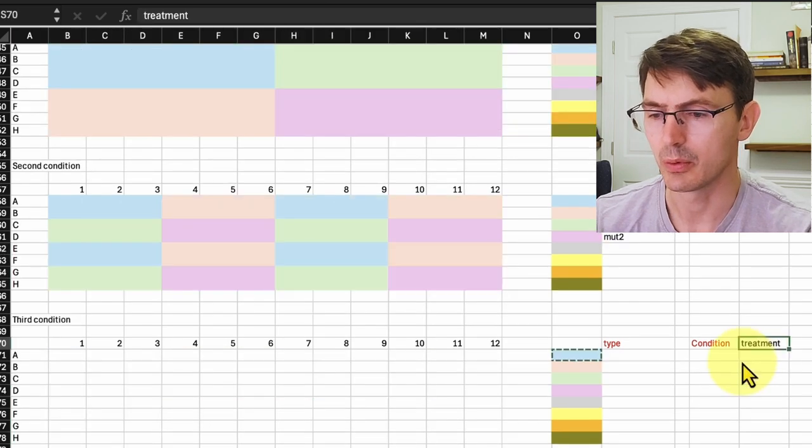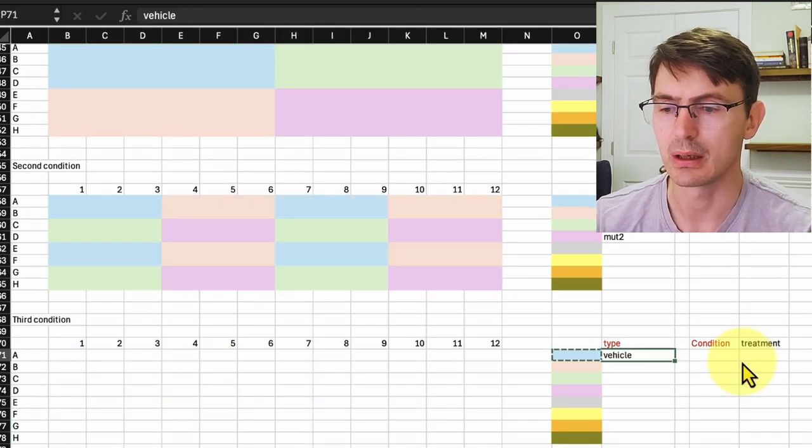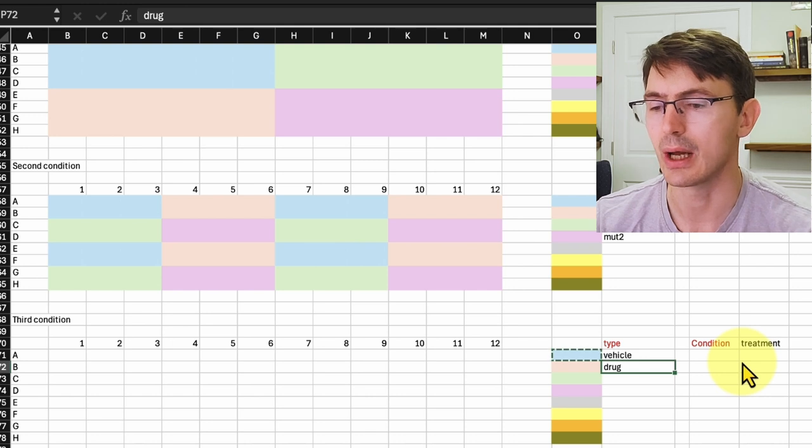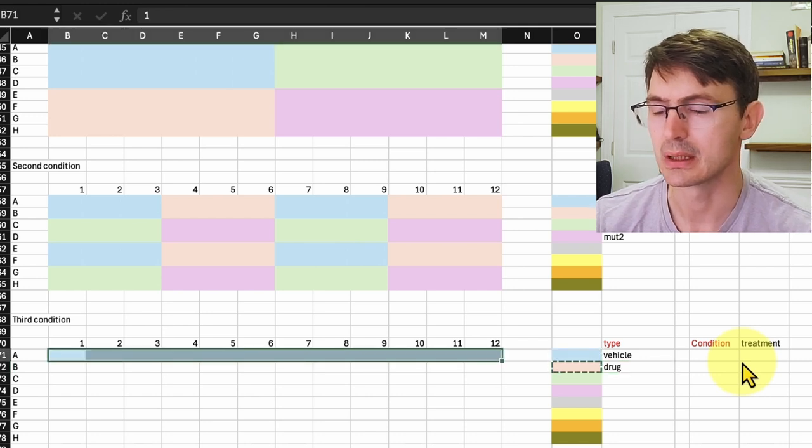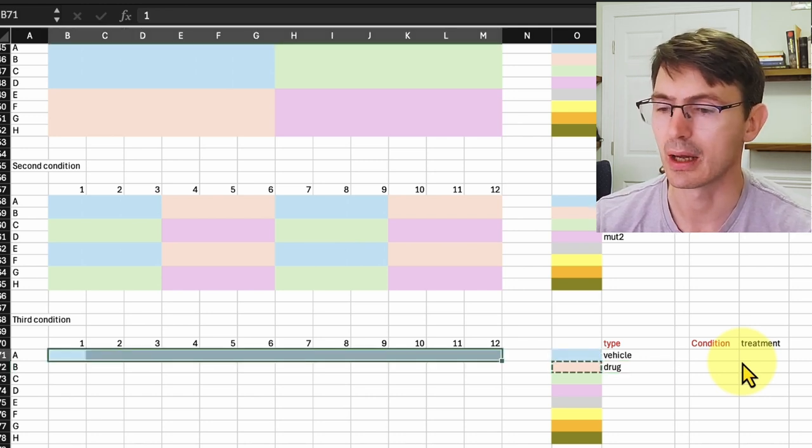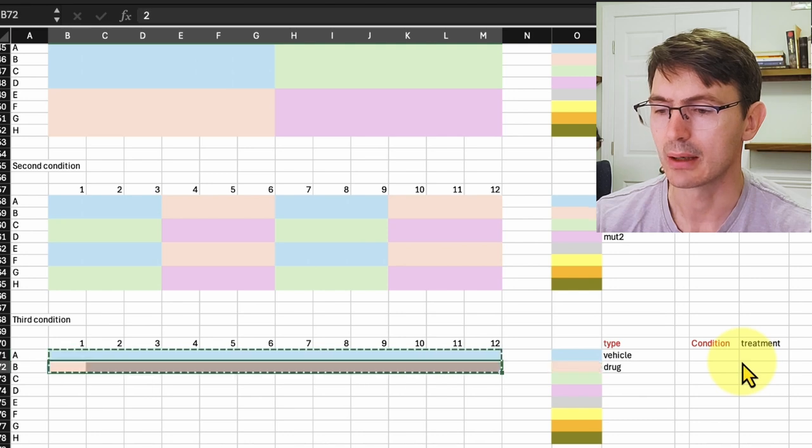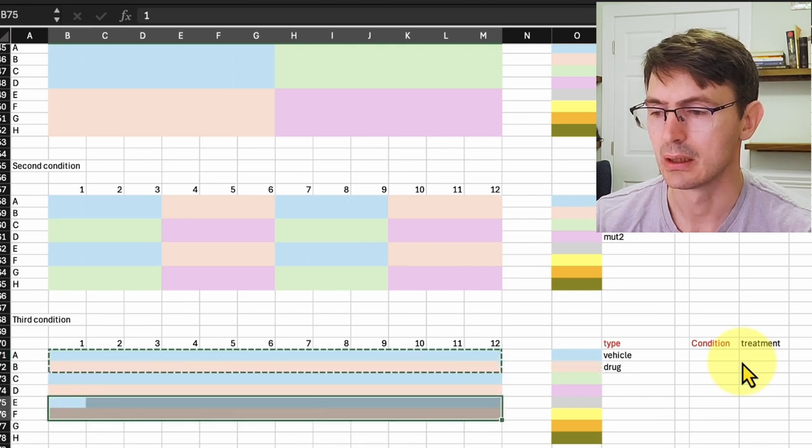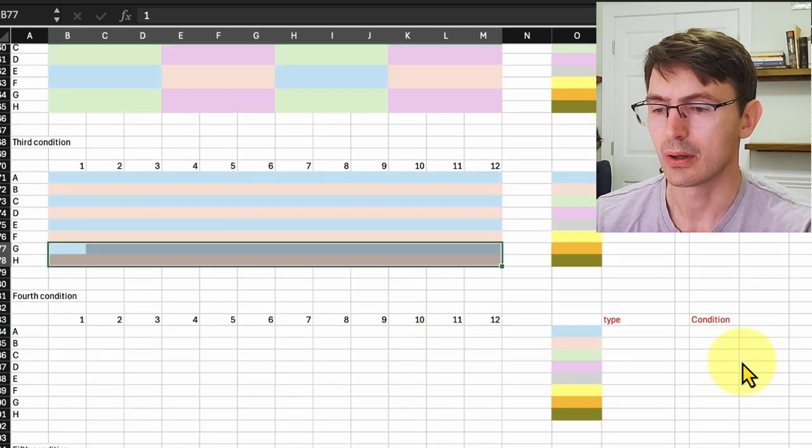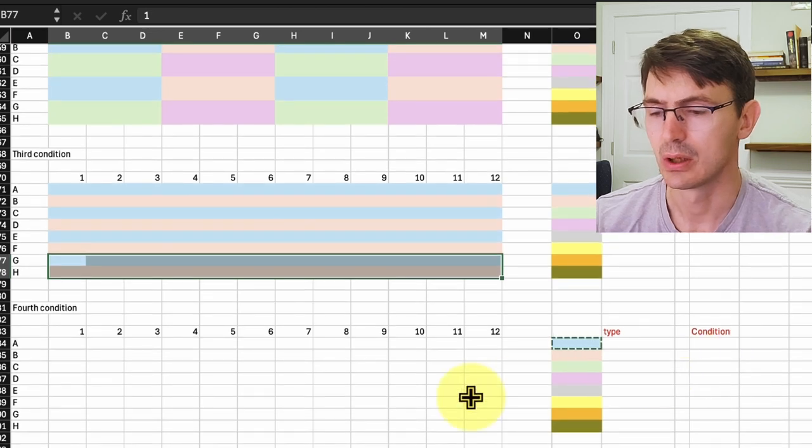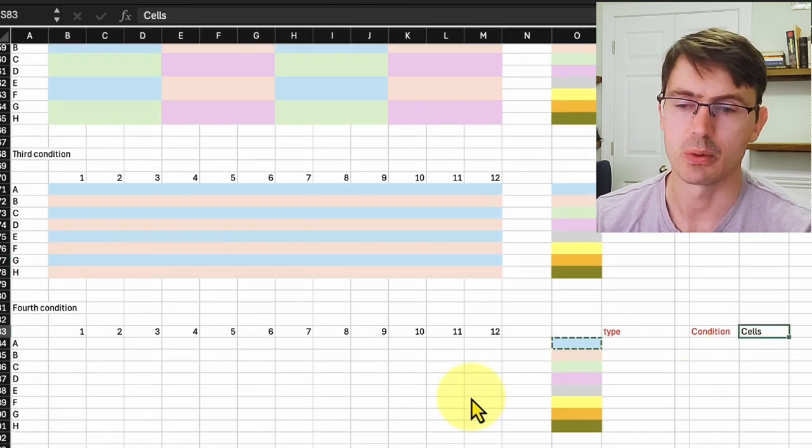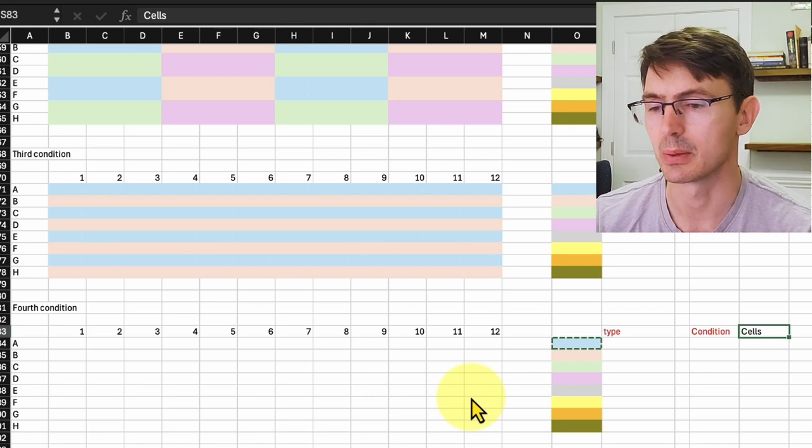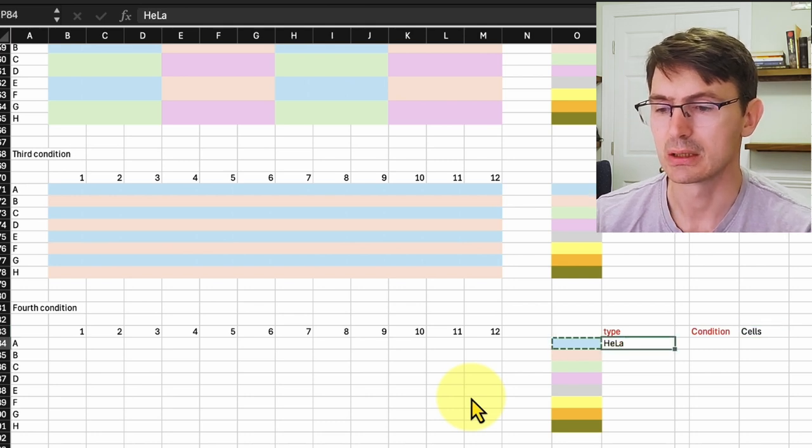We move to the treatment with the vehicle or the drug, and we use for half the cells the vehicle and for the other half the drug, and we did this across the different conditions. For the rest of the variables, we can add generic variables that were used for the whole table. So for example, here we use HeLa cells and we mark them for the whole plate.